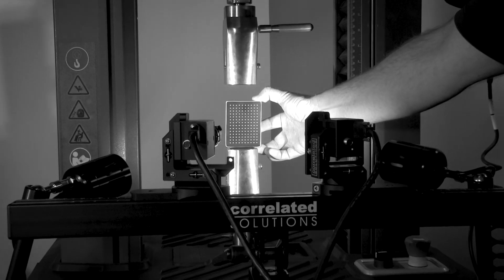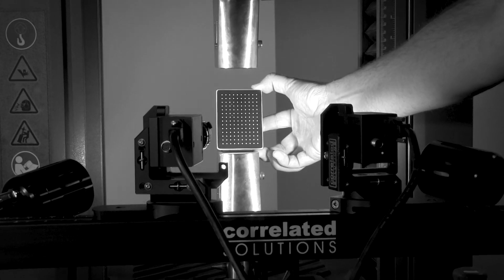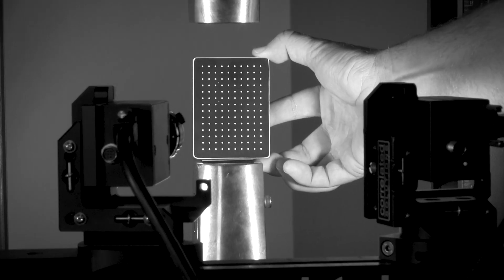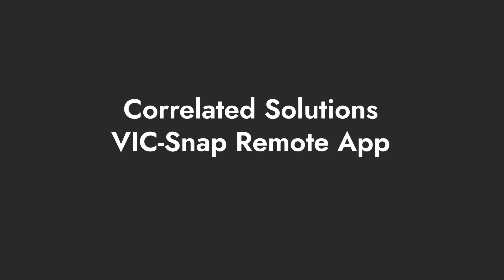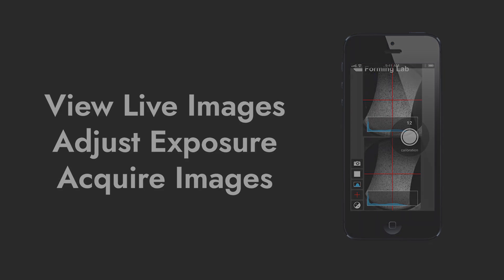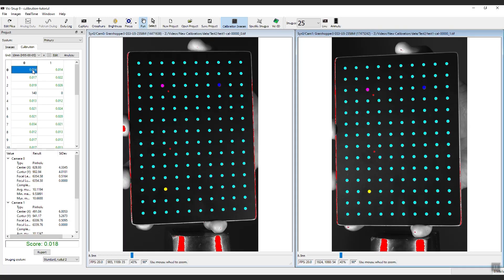As you capture images, watch out for your fingers and shadows. Try to tilt the target as much as possible to avoid glare while still being able to extract points. Calibration can be tricky for one person or in unusual testing situations where the sample is far from the computer. This is the reason we have developed the VIC-Snap remote app. Available for Android and iOS, this app allows users to conveniently view live images during camera setup, adjust exposure, and acquire images using a mobile phone or tablet. In this example, 26 images were taken — remember, 0 is the first image.